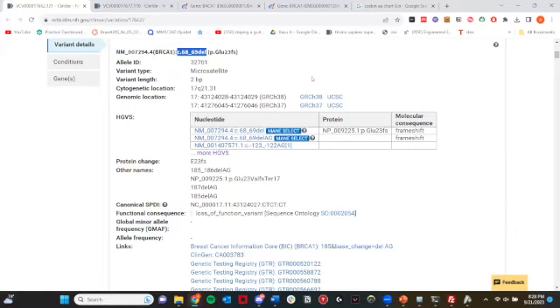But this is pretty upstream, only at base 68. The BRCA1 gene is a very big thing. You already know that. And it's screwing up starting from position 68 and so on. Then the BRCA1 with that mutation wouldn't work properly. That's a frameshift and a very deleterious mutation.